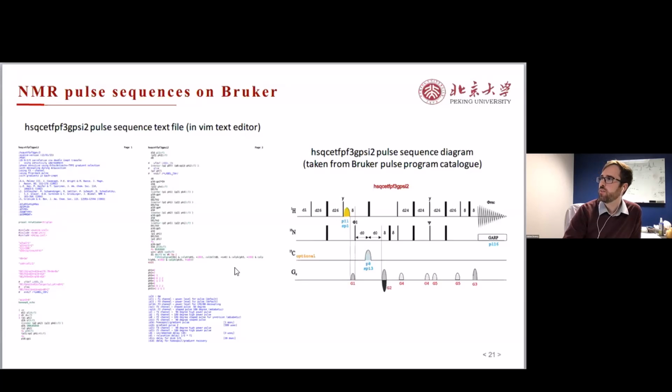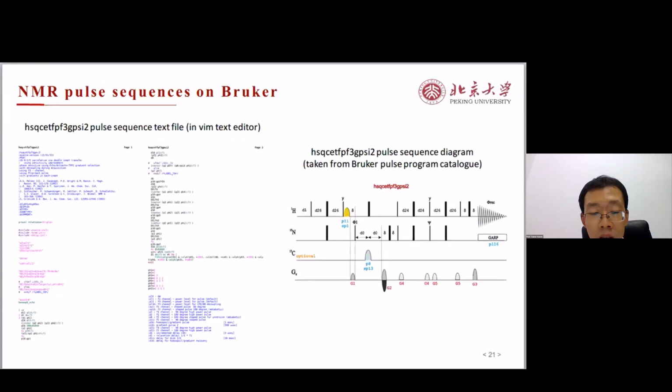We also have a question from Gazelle. When using fast sequences, what is the technical limit, what is the minimum time for a pulse sequence? You mean the fast technical limit? Minimum. I think it depends, I forgot. I think it depends on which version of the fast sequence is used.